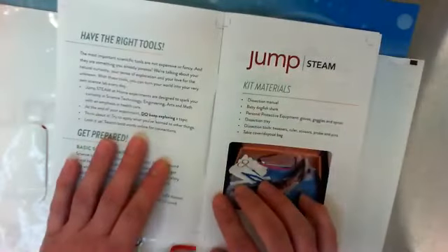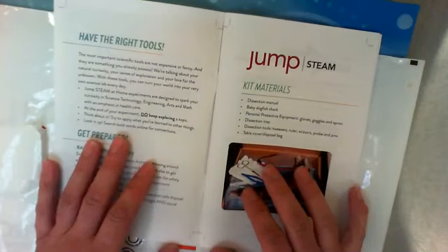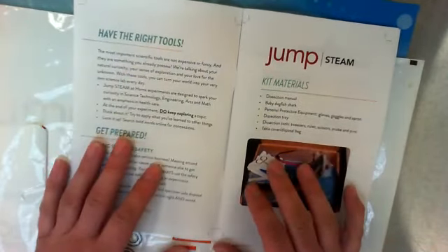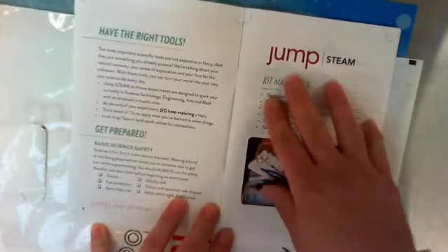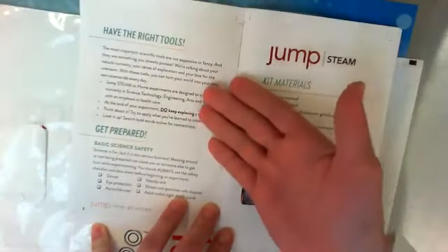So find your questions, test it. If you're in the eyeball and you want to know more about it and we don't have time to do it, set the eyeball to the side and dissect it afterwards the rest of the way. If you want to know about the muscles around the eye and see how they work, play with them. We're not going to talk much about it, but do what you want. We're not going to dissect out muscles very much in the shark body, but if you're curious, I'll show you while we're doing this how you can dissect to the muscles and find out what's moving what. Right? Have the right tools.